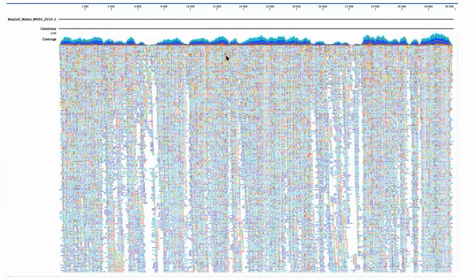So what happens is after you get those short reads out of the next generation sequencer, those reads need to be extracted from a FASTQ file or from an SRA file and mapped onto a reference genome. Now that reference doesn't have to contain perfectly the same sequences. It could have a variety of different regions that maybe don't have a very good mapping quality.